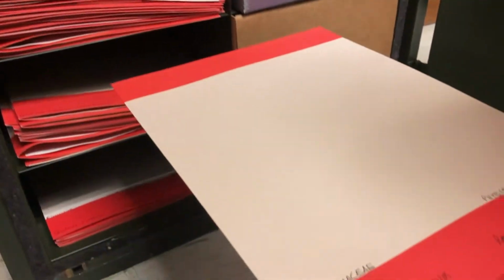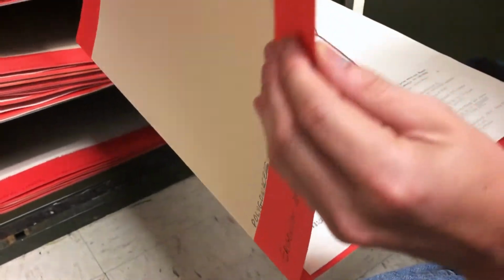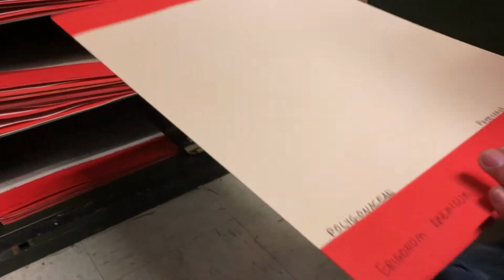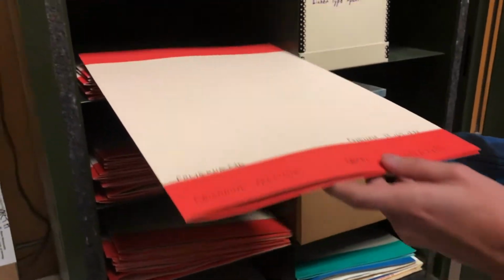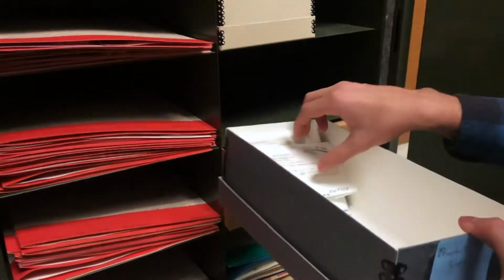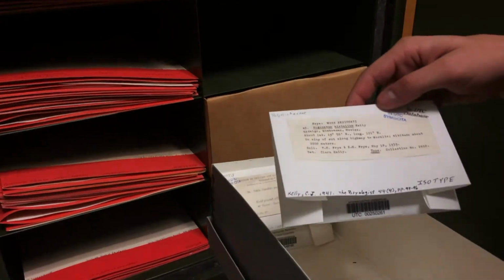All cabinets are kept under lock and key. That way it is safer for the collection as a whole. That way it is not handled too terribly much. Right here you'll see our bryophytes in our standard bryophyte package with the name on the bottom and the type status on the right side.